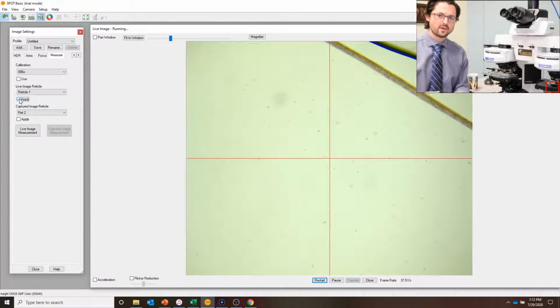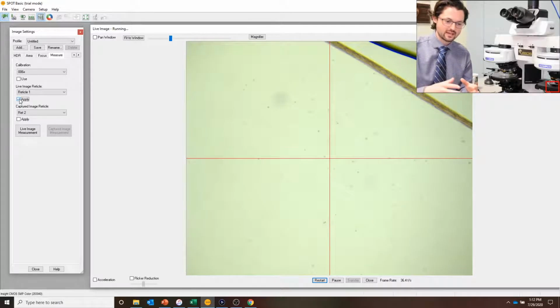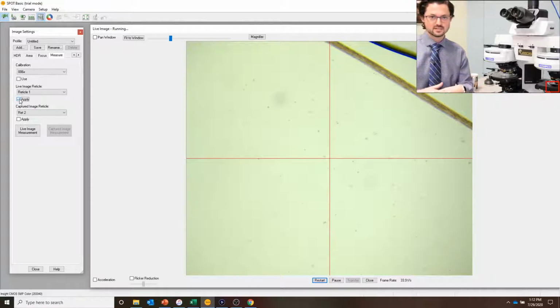And the reason we do that is that the higher the magnification objective you're working at, the more critical getting these centration alignments is. Because even if you're off a little bit, you'll have to do a much bigger movement, and it can be harder to get everything centered up if you don't have centering positions for those higher magnification objectives.